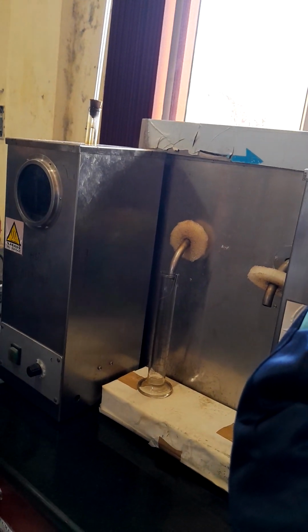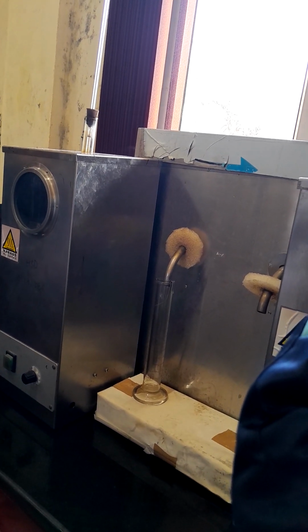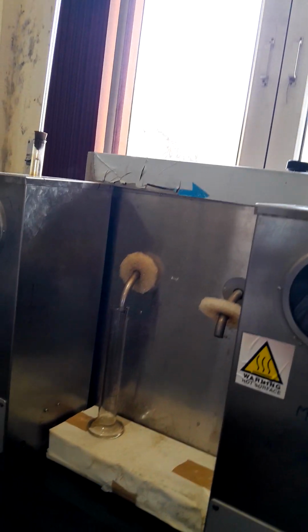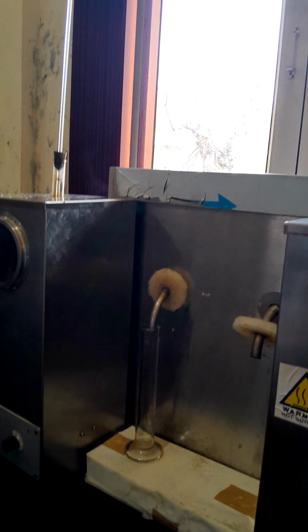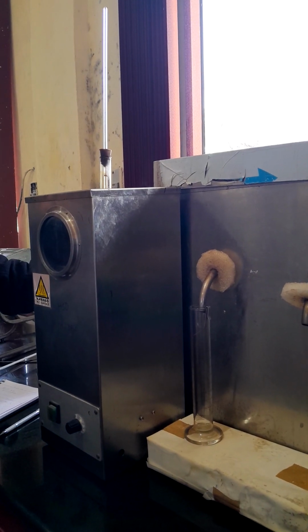While you are doing the diesel by D86, or you are going to check the quality of the diesel by D86, your condenser should be at 55 to 60 degrees centigrade. Because as I told you, from 270 or 275 there will be a paraffin appearance.